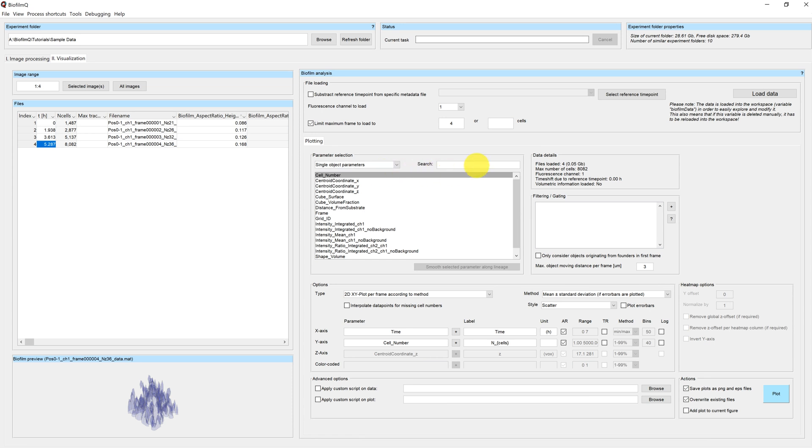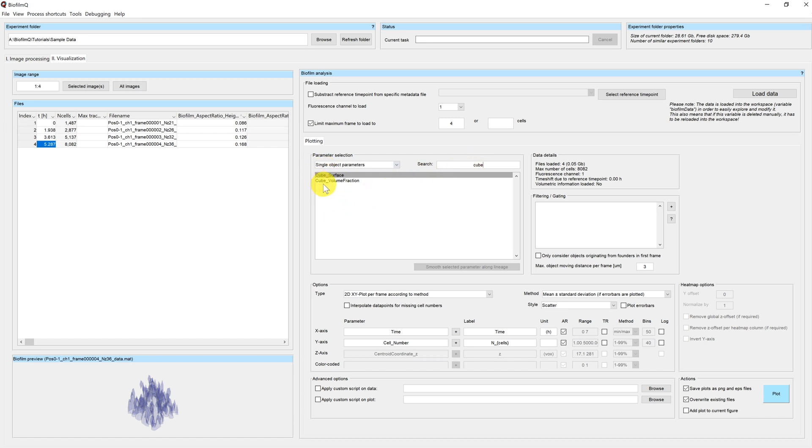I can filter with a search bar here. For example, filtering for the word cube and only parameters are displayed which contain this word.